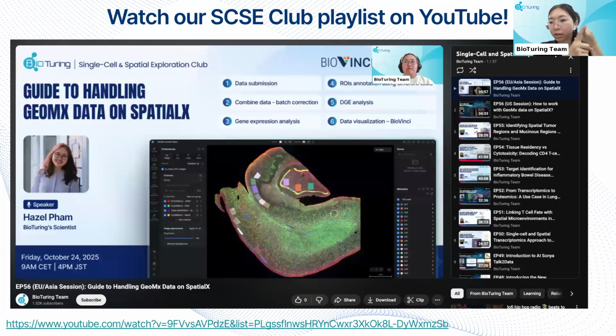So once you have your CDR3 sequence, what kind of sequences will that receptor recognize? Sorry, I can't remember off the top of my head right now, but those are the two main things that we are looking to add to our tool in the next iteration.